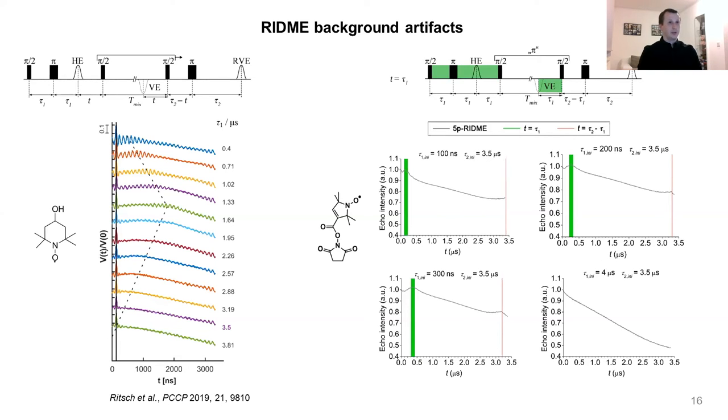In order to have an idea what can be the origin of this artifact, we looked at the RIDME sequence once again and realized that at the condition when t equals τ₁, we have a subsequence within the RIDME sequence which looks very much like a Carr-Purcell sequence. We have the first interpulse interval τ₁, then 2τ₁, and again τ₁. So we think that the origin of the first artifact in the RIDME background is dynamic decoupling, and that also would explain why the amplitude of the background goes up at t equals τ₁.